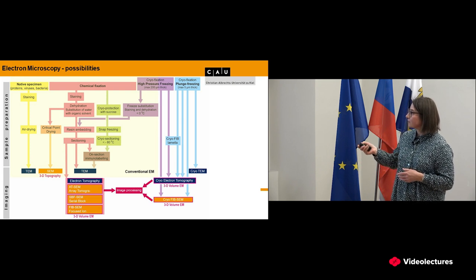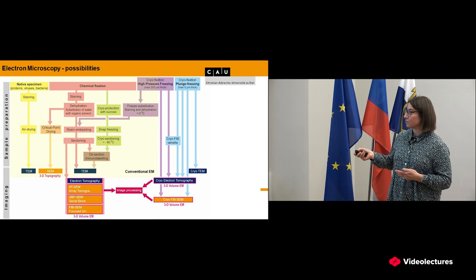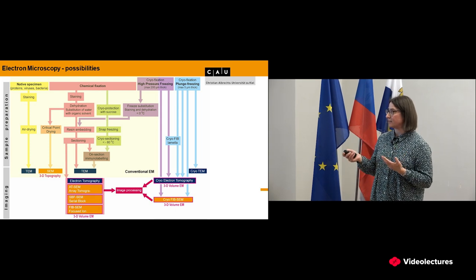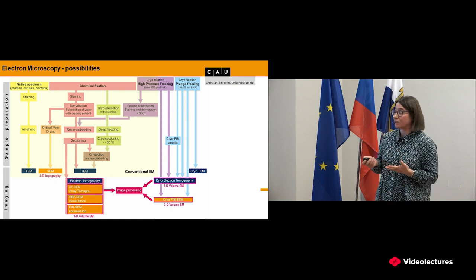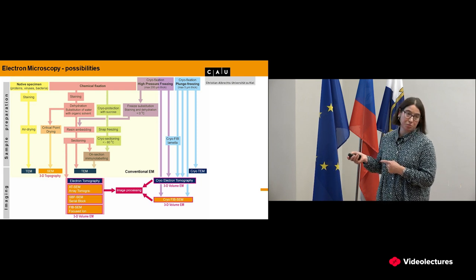And then we have the very modern, in the last 10 years really exploding, cryo-EM. And the obvious thing here is the sample preparation is a lot more modest. Cryo-EM means that you are not dehydrating. Here, everything is dehydration or cryoprotection and later dehydration. Here, we are freezing the water, and we are looking at the samples in the electron microscope in the frozen state. So samples are always imaged below -160. The difference is there's little sample preparation. After images are acquired, there's a lot of image post-processing.